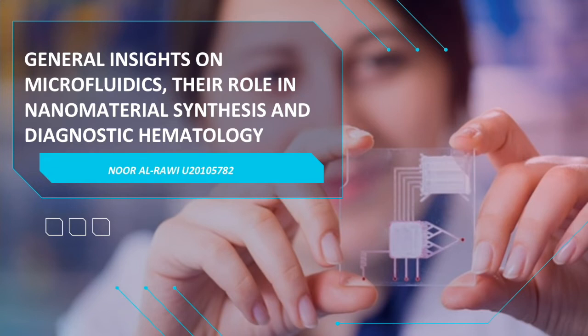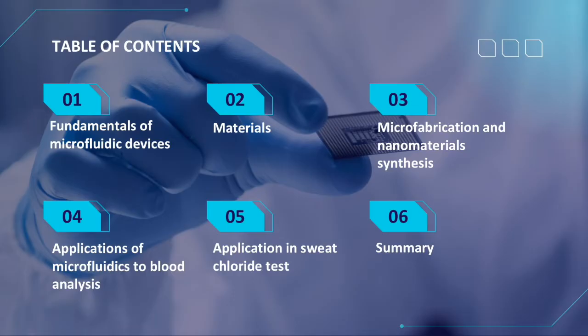Hello everyone and welcome to my seminar presentation entitled General Insights on Microfluidics, the Role in Nanomaterial Synthesis and Diagnostic Hematology. In this presentation, we will discuss fundamentals of microfluidic devices, the materials that are used to create these devices, the function of these devices in the microfabrication and nanomaterial synthesis, and their applications in blood analysis as well as sweat chloride test. And finally, in a graphical abstract, we will summarize everything that we have discussed within the presentation.